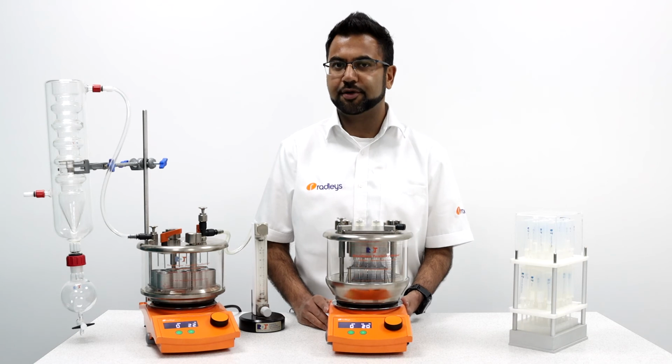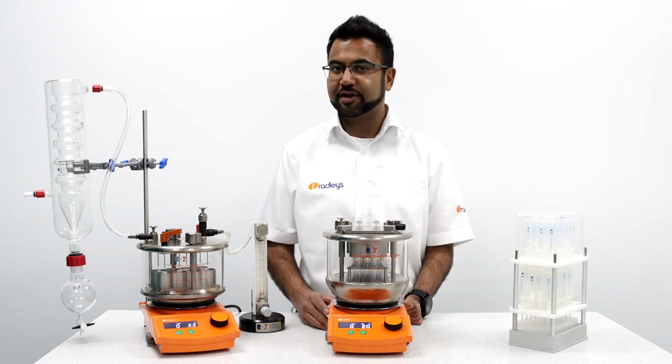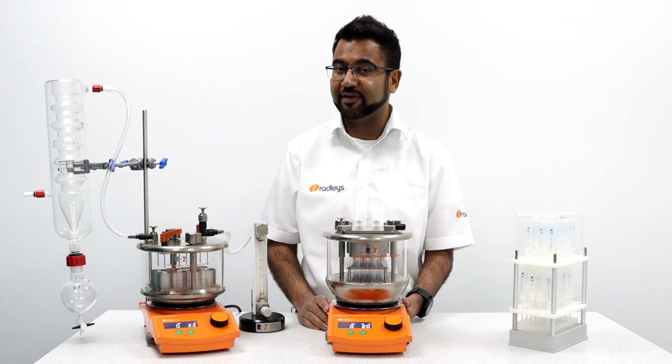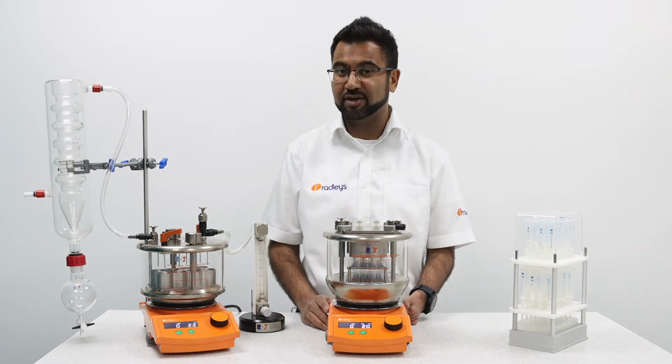So this is what you need to know in order to set up your GreenHouse Plus parallel synthesizer. Watch the other videos in our series to take your GreenHouse synthesizer and convert it into a GreenHouse blowdown evaporator, and to work up and purify your reactions using the GreenHouse workup station.